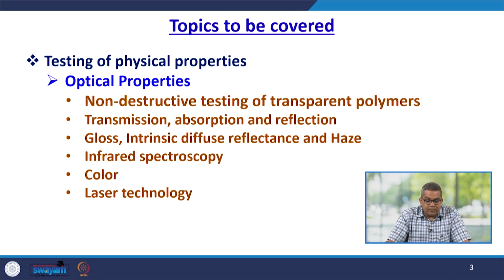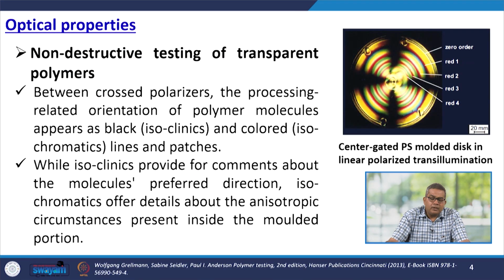In this particular segment, we are going to discuss the other optical properties like non-destructive testing for transparent polymers, transmission, absorption, reflection, gloss, intrinsic diffuse reflectance and haze, infrared spectroscopy, color and laser technology. Now, let's talk about the non-destructive testing of transparent polymers.